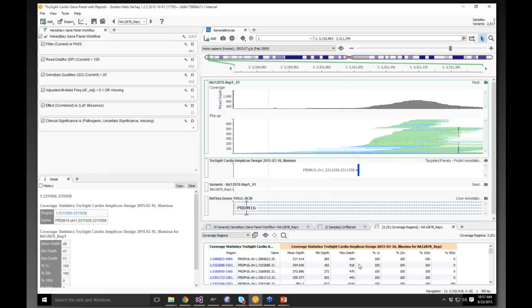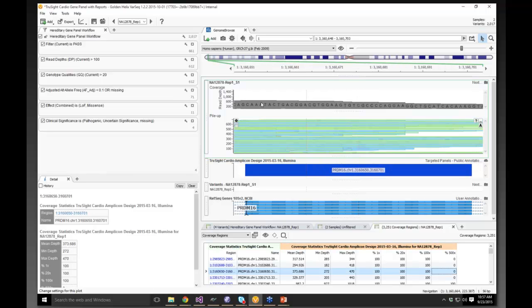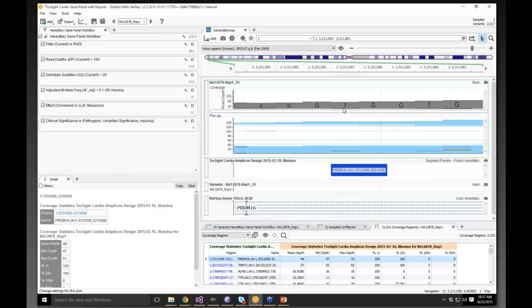And as well as, of course, you can do this at a variant level. So you can do the QC if there's a need to sort of introspect. This is the region. This is its coverage. You can find regions that have low coverage by sorting, etc., or filtering. You can look for poorly defined regions, and okay, so yeah, this has a little less coverage here, and whether I'm okay with that, I'm in the intron of this gene.